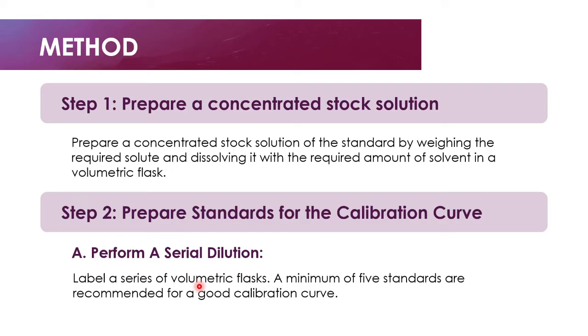The first thing to do is to prepare a concentrated stock solution. To do this, we prepare a concentrated stock solution of the standard by weighing the required solute and dissolving it with the required amount of solvent in a volumetric flask.